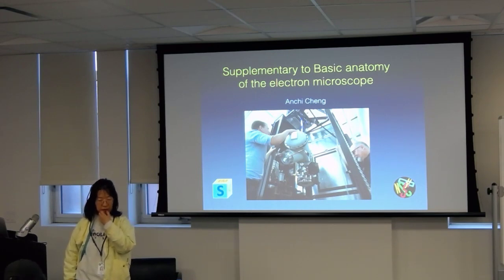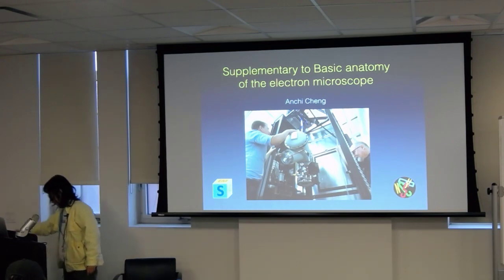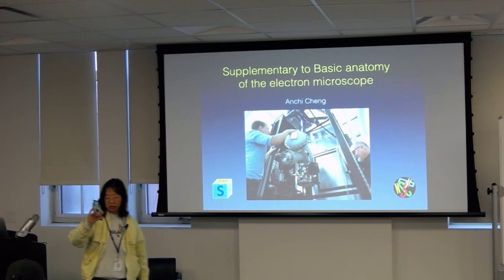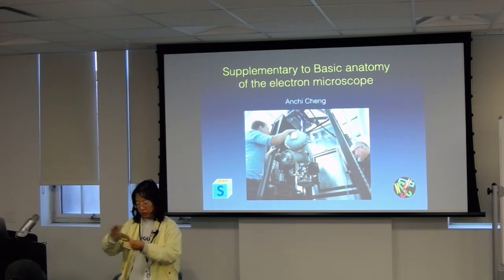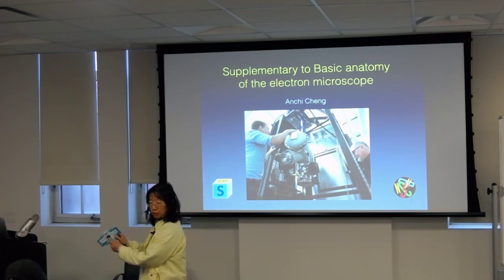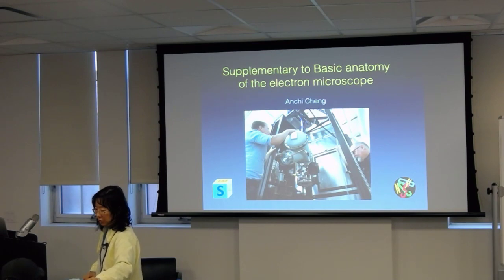And it actually made a pretty interesting microscope. So I have one that says I made this one myself. And I have a specimen in here. If you look from this side, you're going to see what's in there. So you can pass this around and take a look.